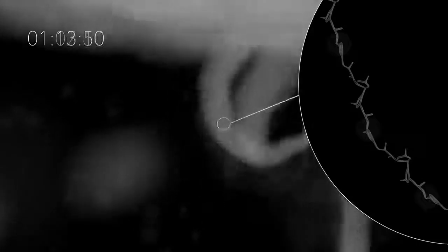In the warm solution, the long twisted strands unravel into thin gelatin threads, allowing the trypsin to move in and cut each thread into peptides.